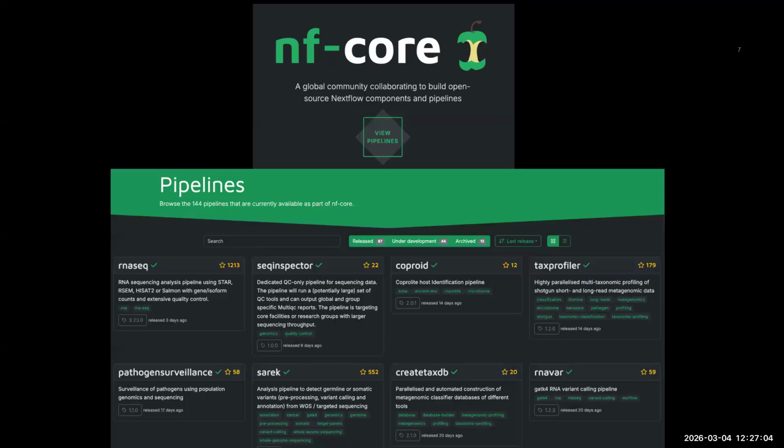And importantly, if you've never really seen the NF-Core website, I wanted to do a quick walkthrough with it and give you an example documentation page from our workflow. So if you go to the NF-Core website, there is a lot there, but the key thing will be the pipelines. And if you do click on View Pipelines, you're going to encounter a page similar to the one that I have here below. And this is where you're going to be able to browse the workflows. And you can actually start typing specific keywords such as RNA-Seq or single-cell RNA-Seq or ATAC-seq, whatever, and it will filter that down a little bit for you. The ones that are at the top will always be the ones that just had a release, so that always gets updated according to releases.